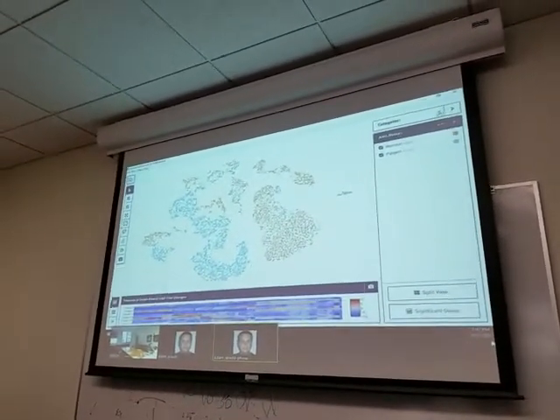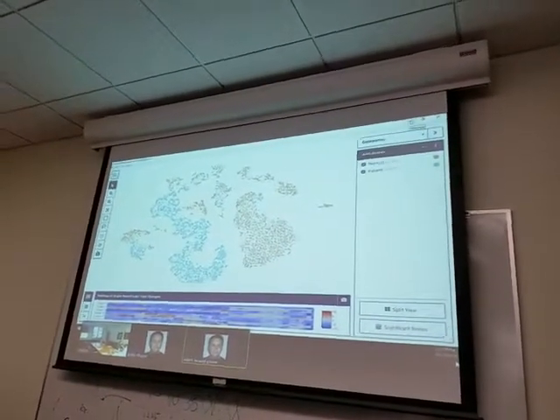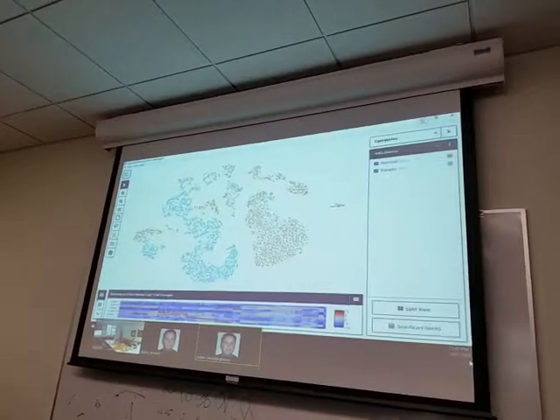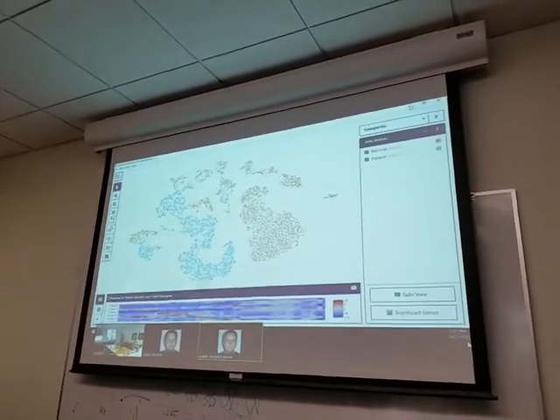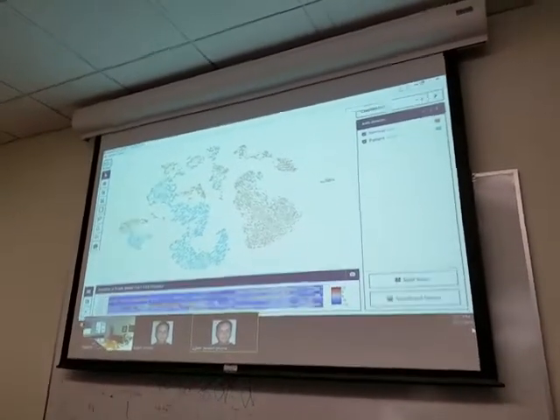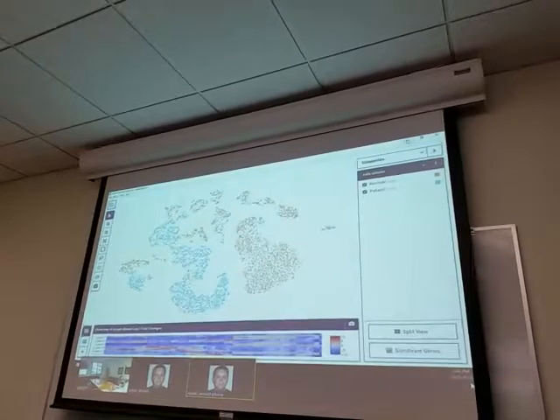She's saying pull out the ones that are highly mutated, or list the CDR3 mutation high versus low, or clonality. Even the CDR3 length, all kinds of things that people typically do with the VDJ. Instead of doing one by one, we can look at it in a certain population way.